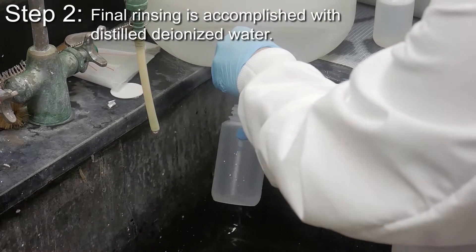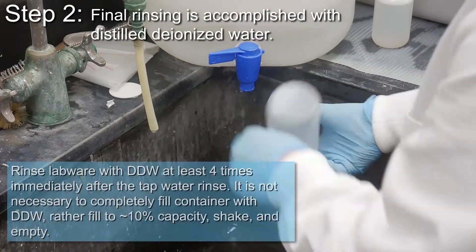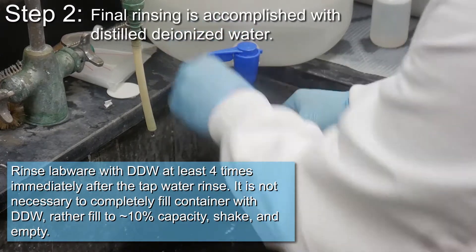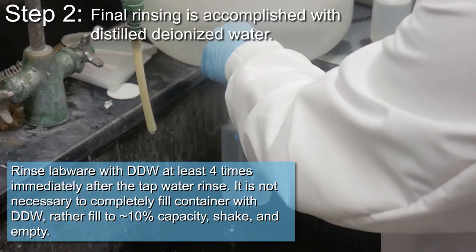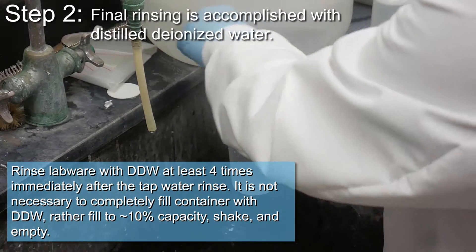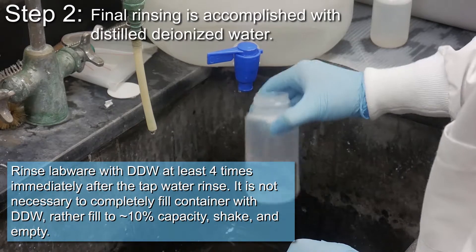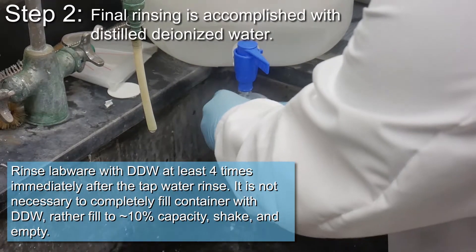Final rinsing is accomplished with distilled deionized water. Rinse labware with distilled deionized water at least four times immediately after the tap water rinse. It is not necessary to completely fill the container with distilled deionized water. Rather, fill the container to 10% capacity, shake, and empty.